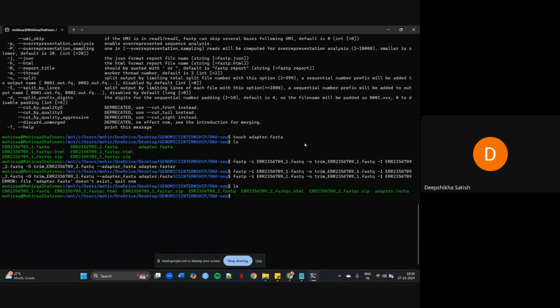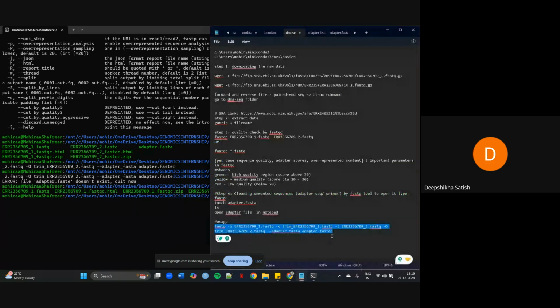What is the command you are giving? The spelling is wrong, Moira. Oh, adapter dot fasta. Okay, now try that. Now try this.